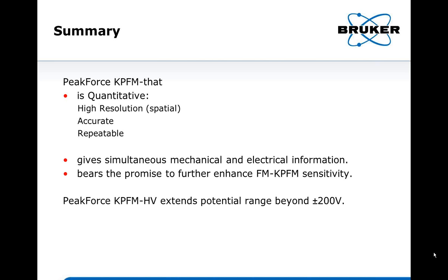Maybe a longer explanation there. In terms of the KPFM performance, I would say if you do tapping mode frequency modulation and if you do KPFM frequency modulation, you get similar data. On the KPFM side, they are similar, except in some cases for tapping mode, the artifact is hard to avoid. And the major difference is for PeakForce tapping mode, you get simultaneous mechanical property mapping.